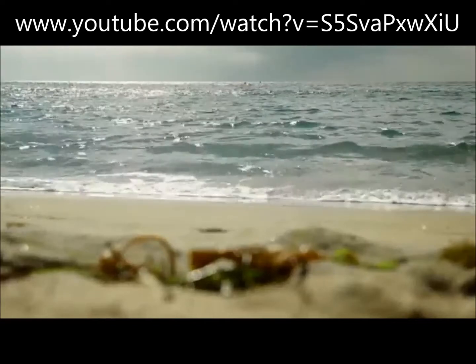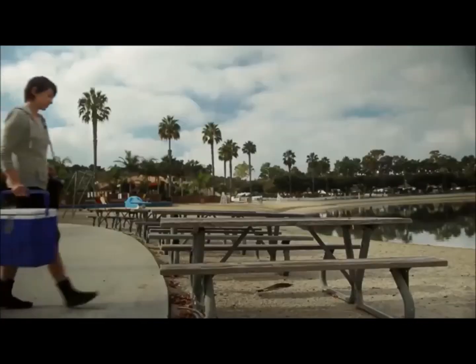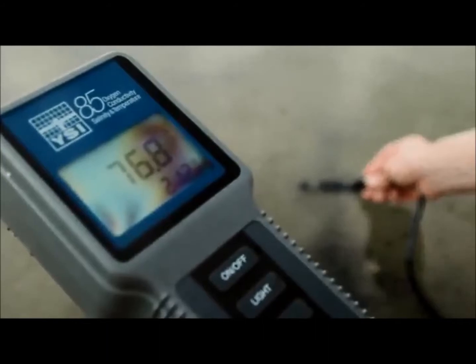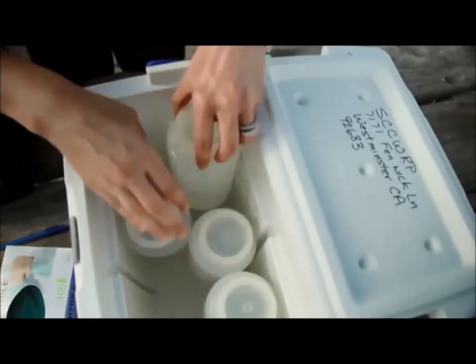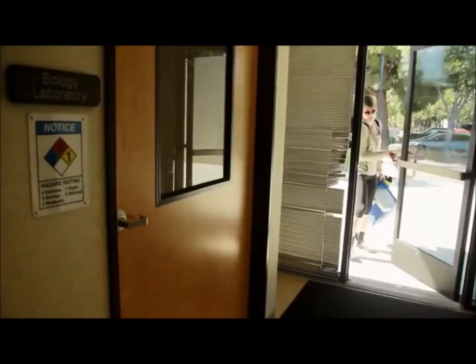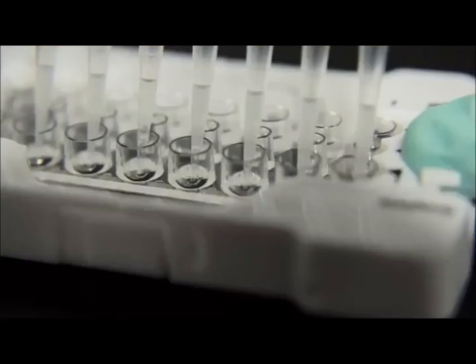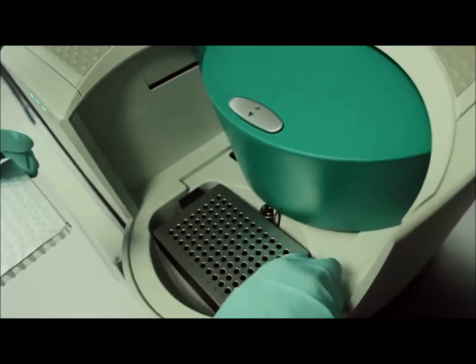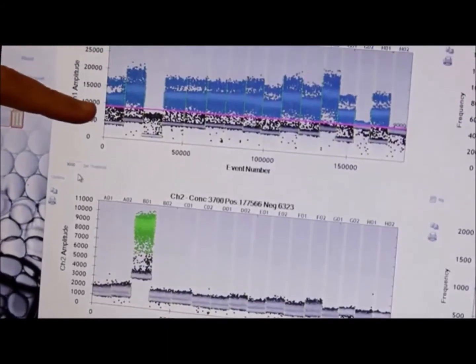The importance of monitoring the ocean for human impacts is multifold. In the case of my department, we're interested in using the most advanced methods to protect public health from pathogens that may come off the land. Our hope with this new droplet digital PCR assay is that this becomes a valuable tool for monitoring agencies so they can reduce the variability in their results and lower the chances of having false negatives.